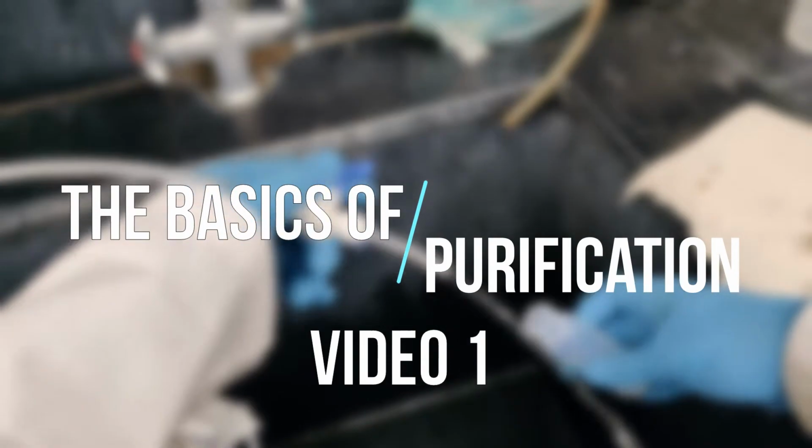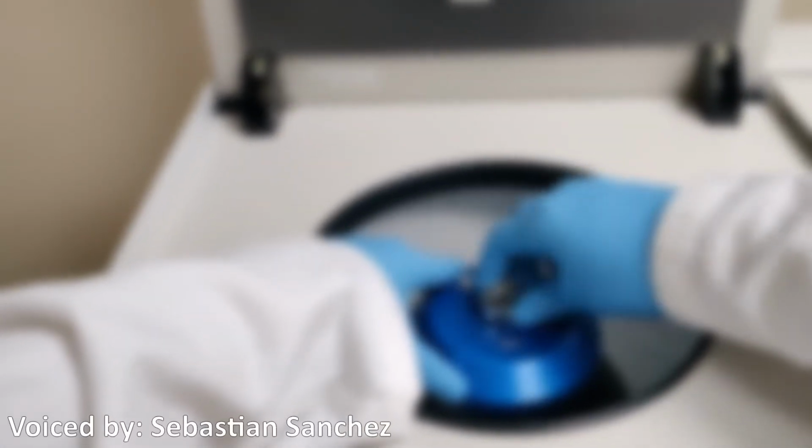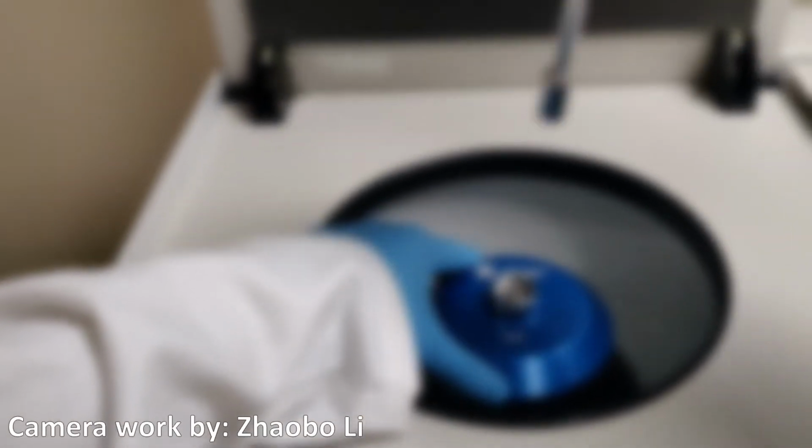Protein purification is an essential process within the field of biochemistry. If you're already familiar with expression, you should know our proteins synthesized by the expression vector are produced along with other natural proteins and byproducts of bacterial cells. The goal is to sift through these impurities and eventually get to a pure sample we can study and characterize.